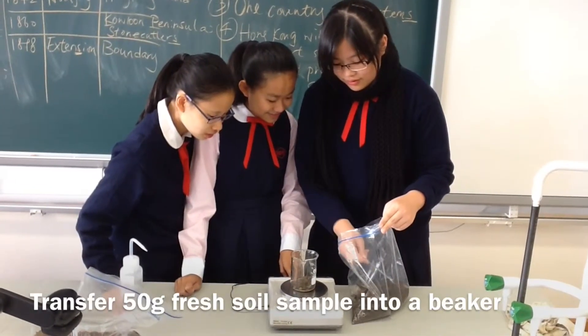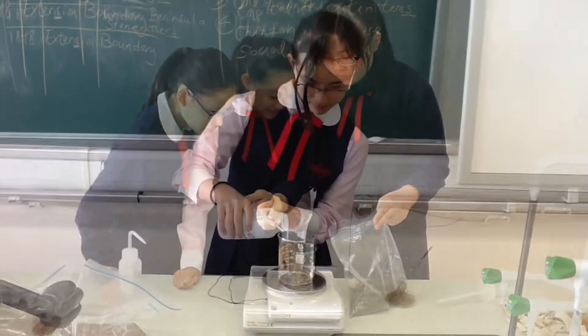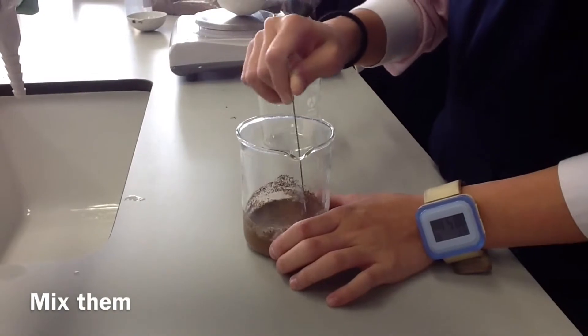Transfer 50g soil sample into the beaker. Add 15ml deionized water into another beaker. Mix them together.